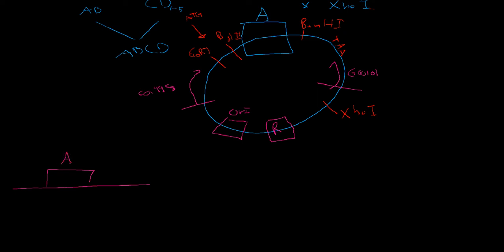If there were, you'd have to sew it out. And we want to get A into that plasmid. First thing we're going to do is design a few oligos. We're going to have an oligo binding to A, a forward oligo and a reverse oligo. They're going to be binding to A there. And we're going to be adding on a little floppy tail to our oligo. And on this floppy tail, we're going to actually just put in this sequence.